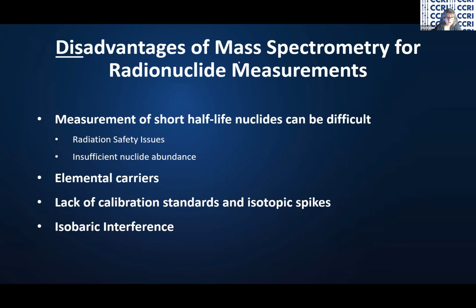Thank you, Richard. So Michael's comment is that producing calibration standards for mass spec for radionuclides has the complication of instability through radioactive decay. I would say duh, but yes. So anything would have to be adjusted over time based on half-lives, which would raise the uncertainties, of course. I think those are very good observations.